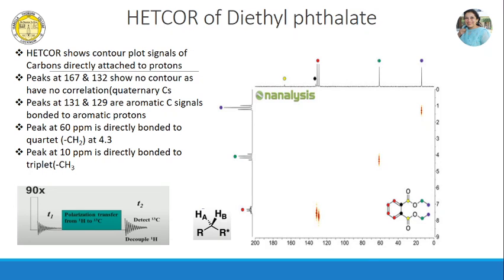They become diastereotopic when we have a chiral carbon attached. So whenever under one line in a HETCOR, the vertical line from the C13 spectra, you have two dots linking two hydrogens on the PMR, that means that those two hydrogens are diastereotopic.